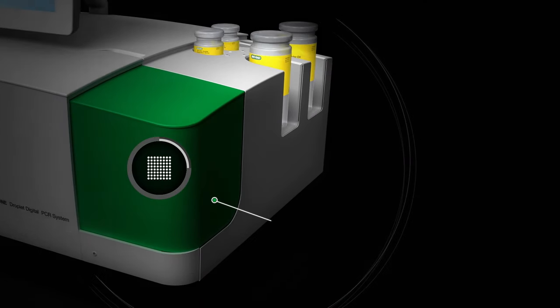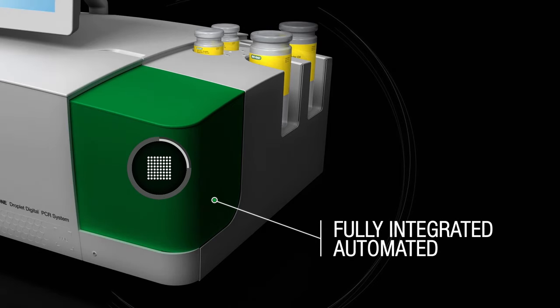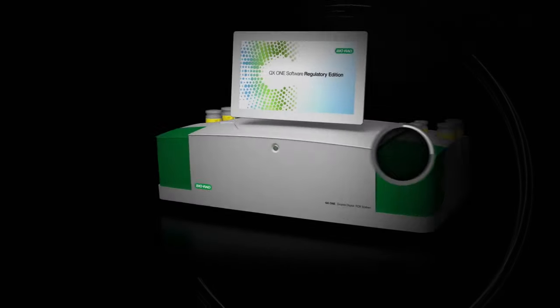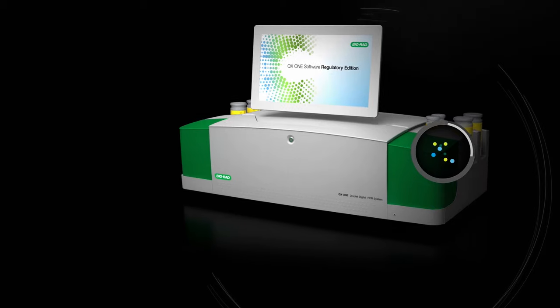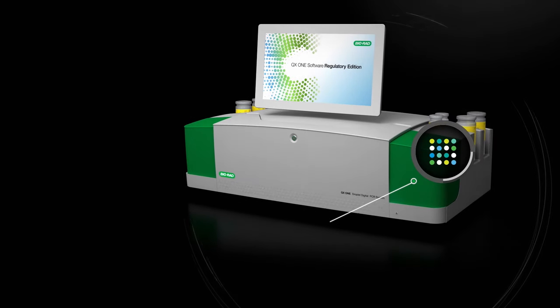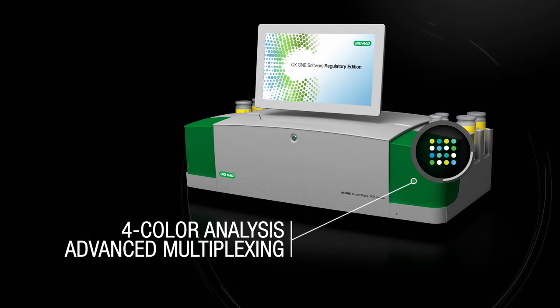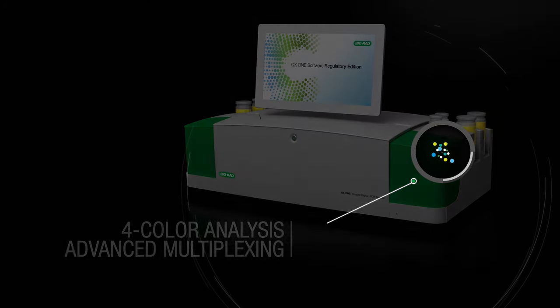The search for fully integrated and automated digital PCR is finally over. With four-color analysis and a new multiplexing supermix, the QX1 is one of the most advanced digital PCR systems on the market.